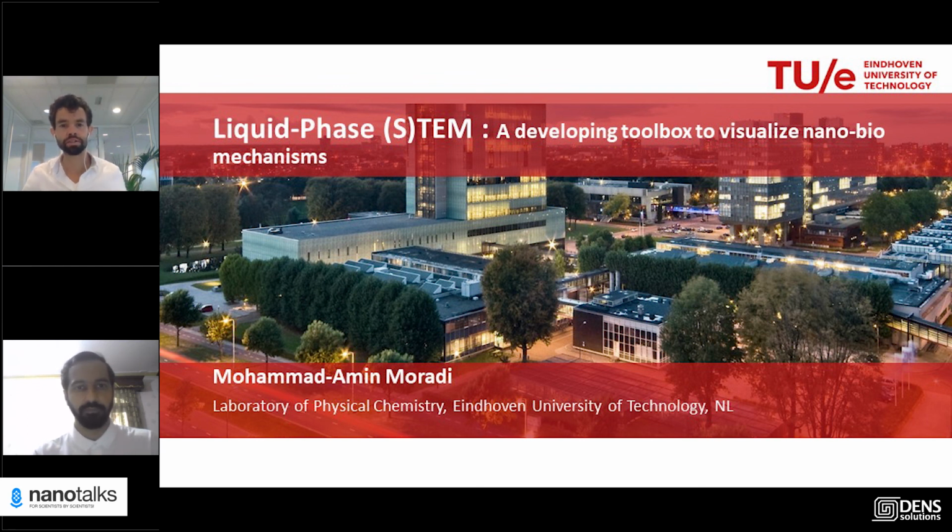All right. He mentioned the polymer itself and the phenomena happening there. I mean, how to take the beam damage into account. Did you answer that part, you think? Yeah, the polymer itself is also part of the system. In our experiments, the bubbling is the first thing that happens before the damage on the polymer. Most of the time, you're not getting there before you have the bubbles formed in your sample. So the first thing to be careful about when working with graphene is actually the bubbling.